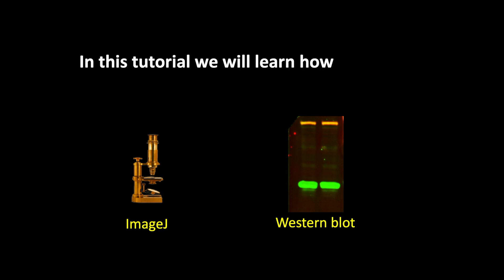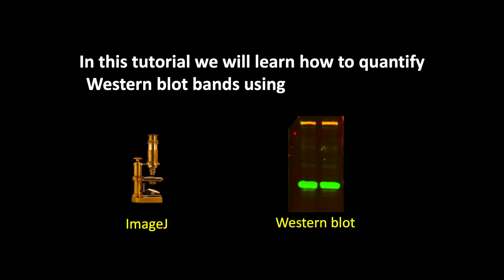In this tutorial, we will learn how to quantify western blot bands using ImageJ software.